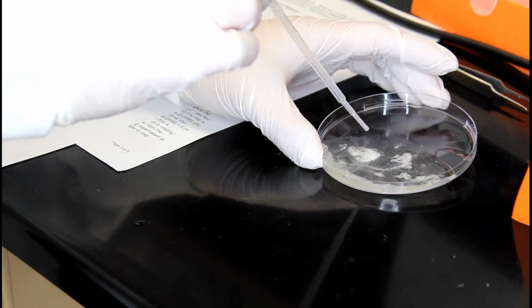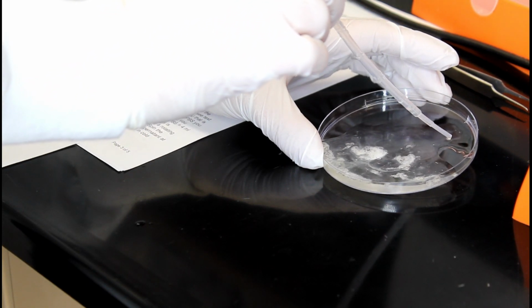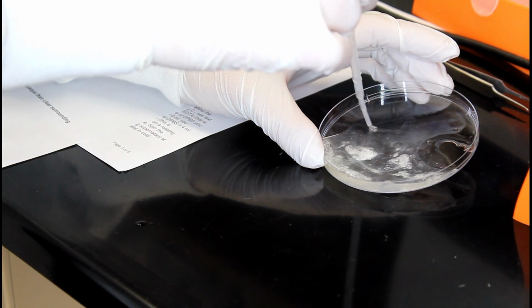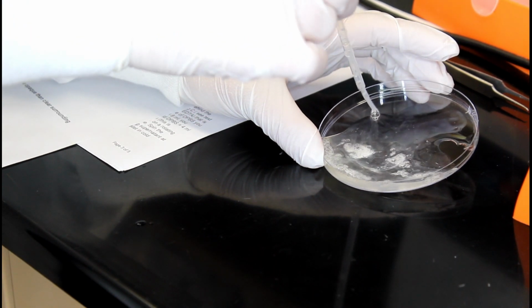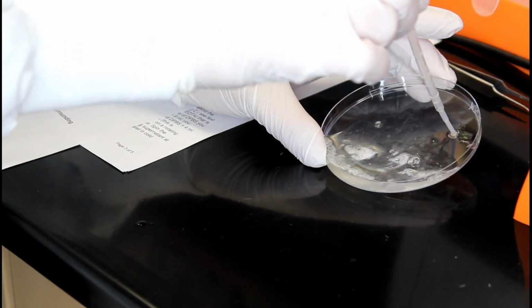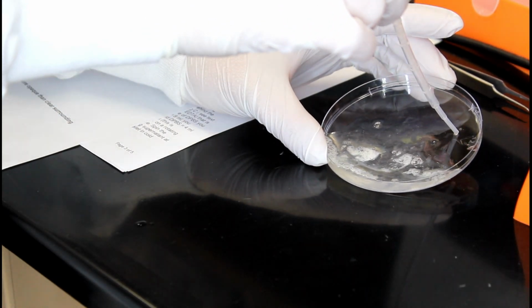Before weighing the sample, if there is obvious clear saliva that can run to the side of the petri dish, take a pipette and remove that saliva from the sample. This we can call saliva avoidance, but note, it is not plug selection.